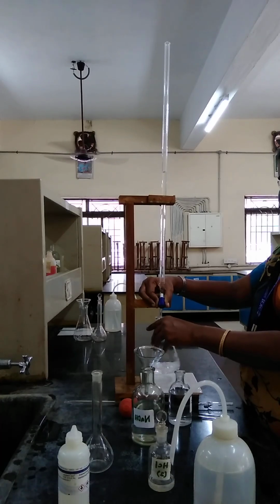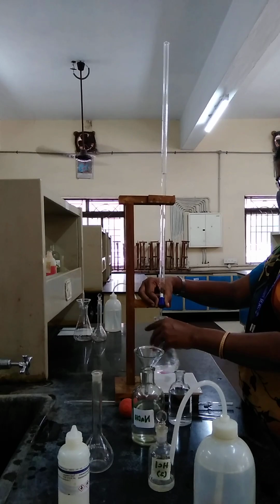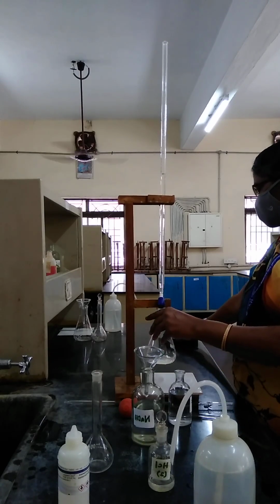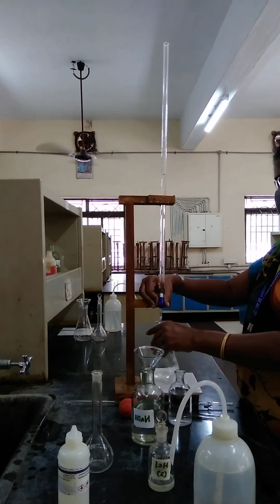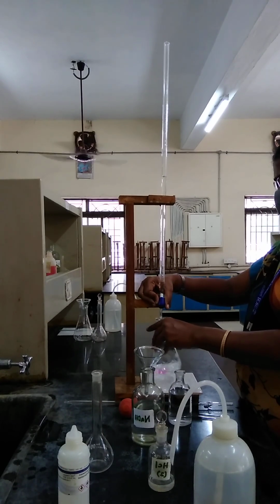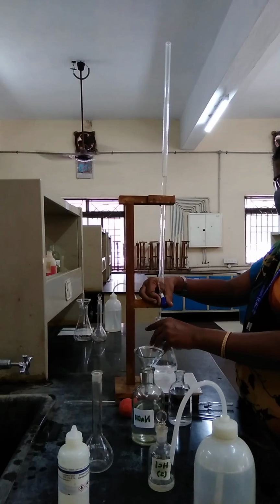So slowly you do it, because we don't know how much volume of the NaOH is required to neutralize the 20 ml of oxalic acid we took. That is the reason we have to go slowly. The first time when you do any volumetric titration, we go slowly. Then whatever range we get, for the second time we can go a little bit faster, up to wherever the range you got for the end point.